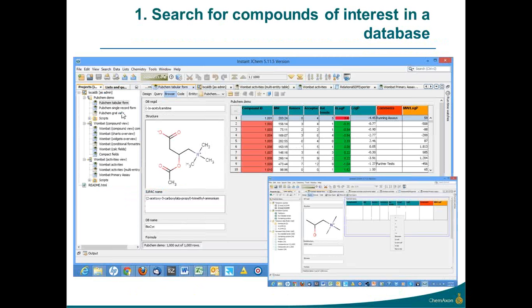With that, let's go and look at the case studies we have prepared for today. We'll start with a simple compound search in databases, because even if you're in industry or in academia, you have so much data, and usually everybody has gathered this together in a database, and not just a simple spreadsheet, but you can imagine that you can use the technology even in common spreadsheets as well.